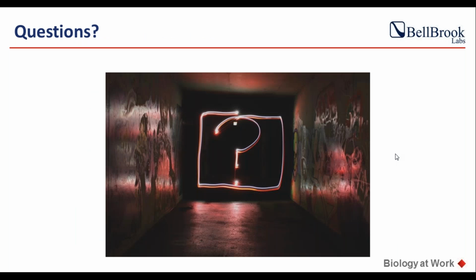Thank you. All right. I have a few questions here, Mira. You showed some enzyme titrations with both FP and TR-FRET. When setting up a screen, what enzyme concentration would you suggest?